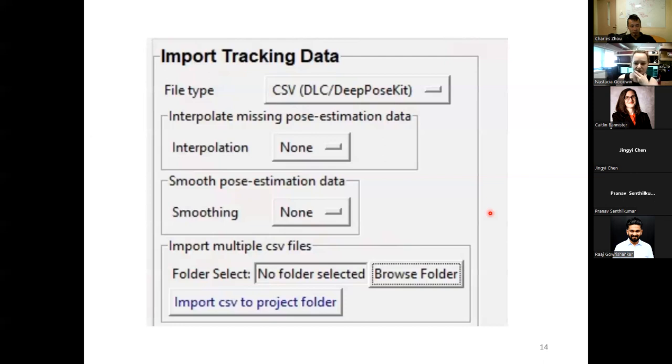When I'm using DeepLabCut, I basically load in as many little video clips as I have. So I'll try for 10 two-minute clips from 10 different animals. I just use their K-means and their automated options, and I pull those frames and label them as best I can.